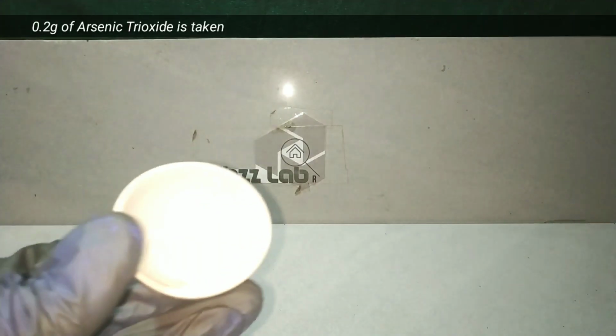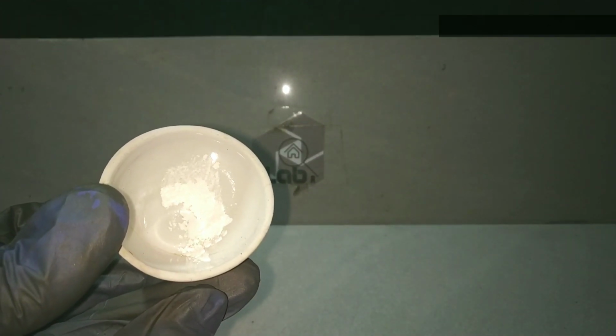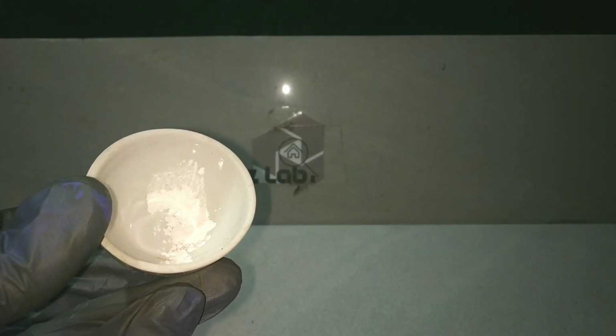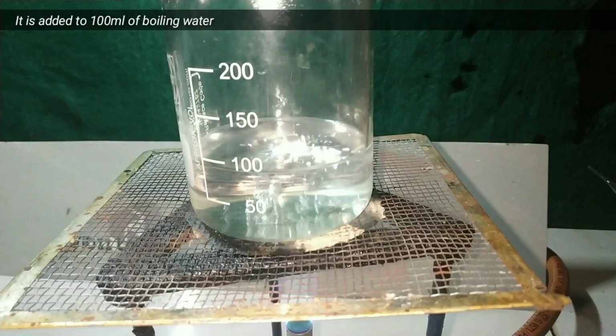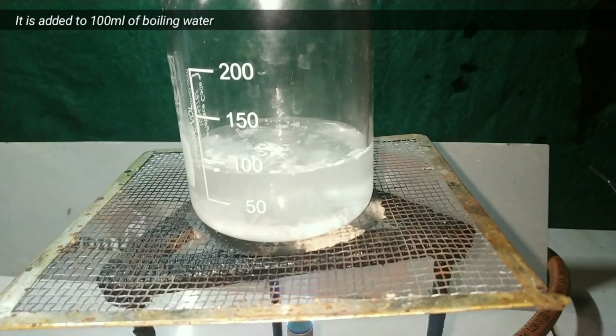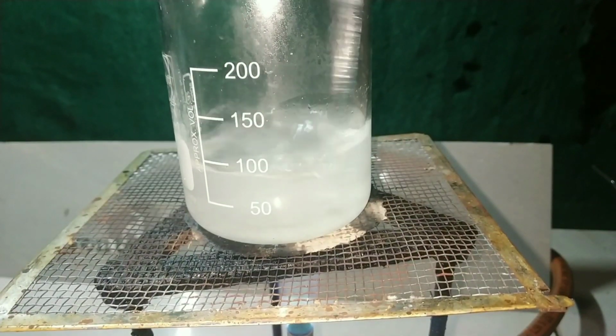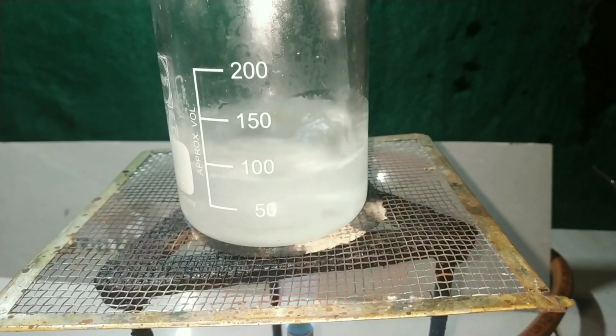Now let us make another lyophobic colloid, that is arsenic trisulfide sol. For that we take 0.2 grams of arsenic trioxide. Be very careful as arsenic compounds are toxic. We then add it into 100 milliliters of boiling distilled water and stir it up well with the help of a glass stirring rod. The solubility of arsenic trioxide is more in hot water.